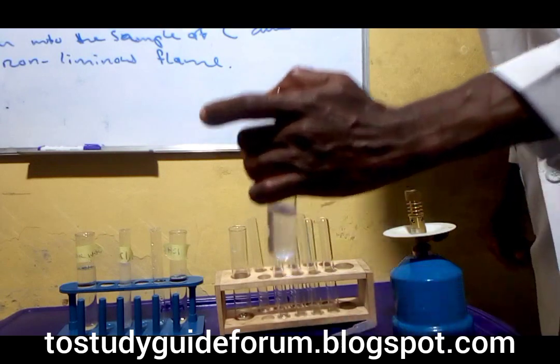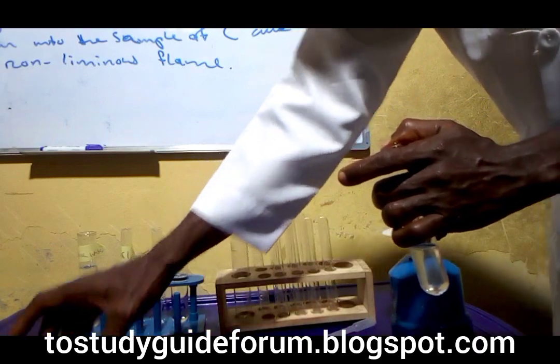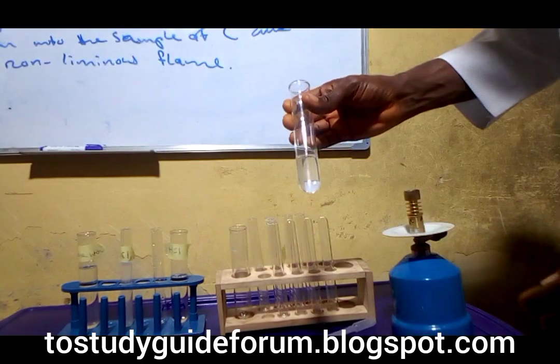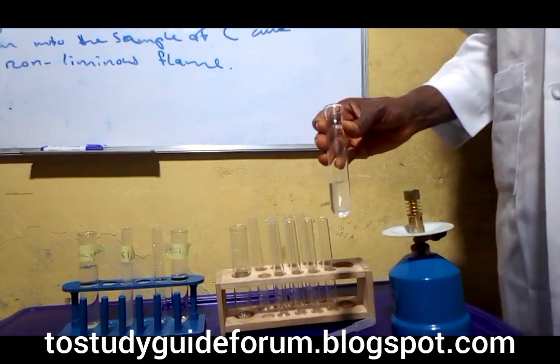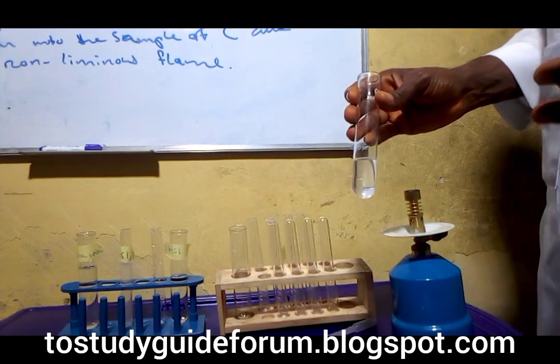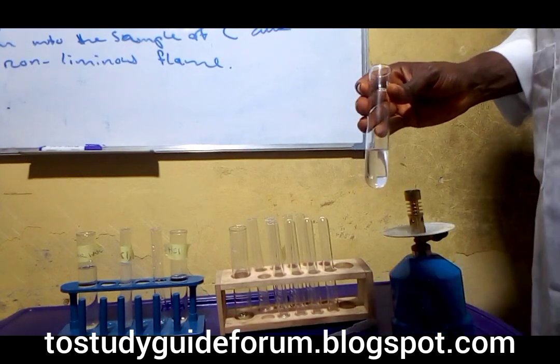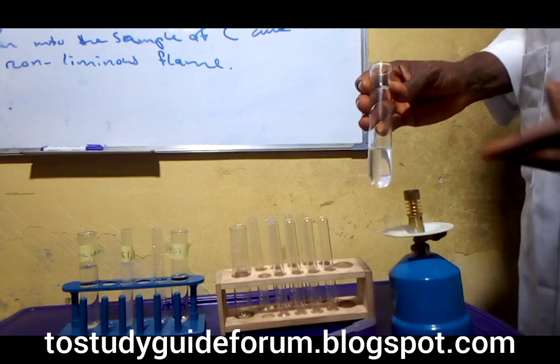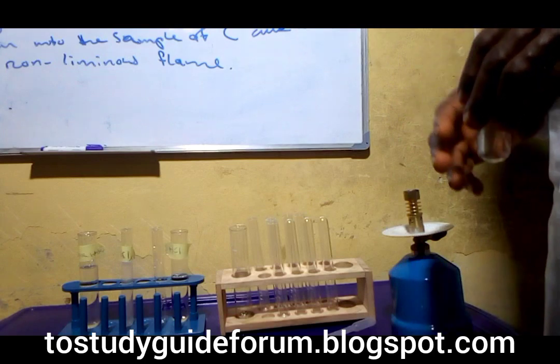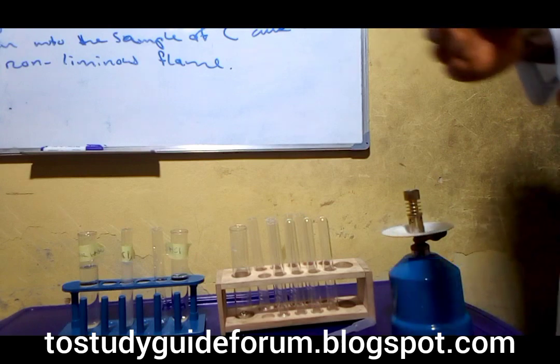Since it's soluble, that simply means the salt in question is soluble. We should be expecting ions like sodium ion, potassium ion, ammonium ion, and then hydrogen trioxocarbonate IV.